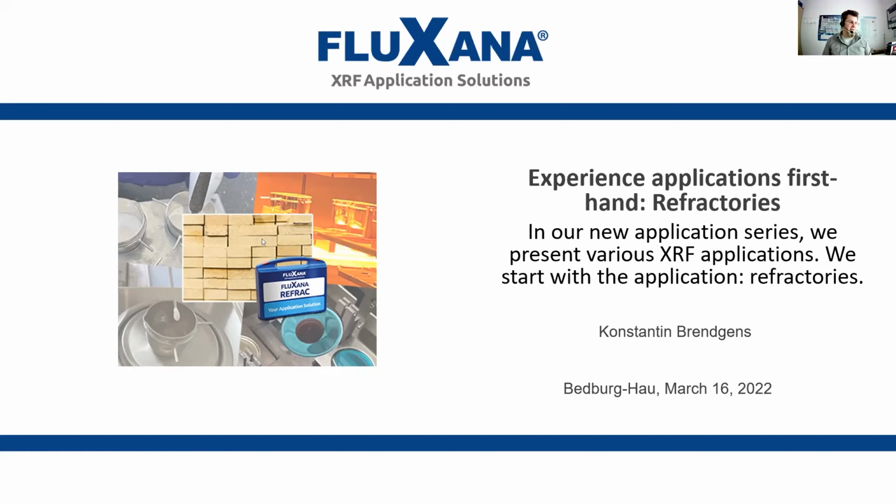Thanks for joining us. Today's topic will be an example of an application done on the XRF. And the application we'll be talking about are actually multiple applications. The material group we will be talking about is refractories, or refractory materials, as they are also called. We want to give you a quick overview of the material and how we deal with it on a daily basis here in the laboratory at FLUXANA.